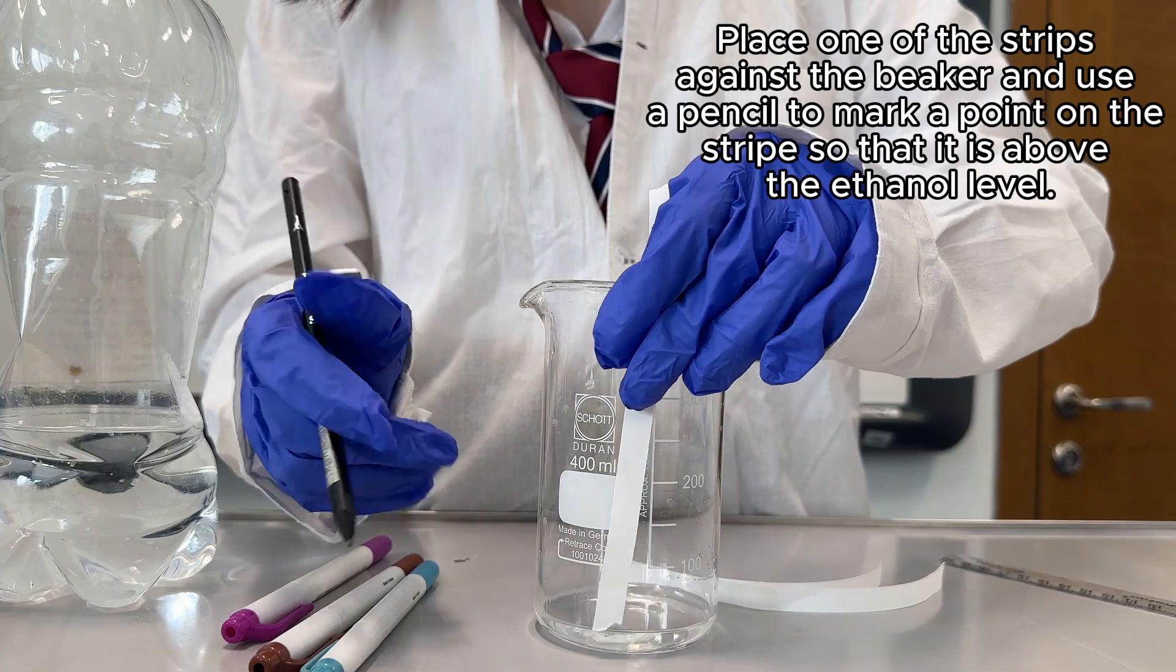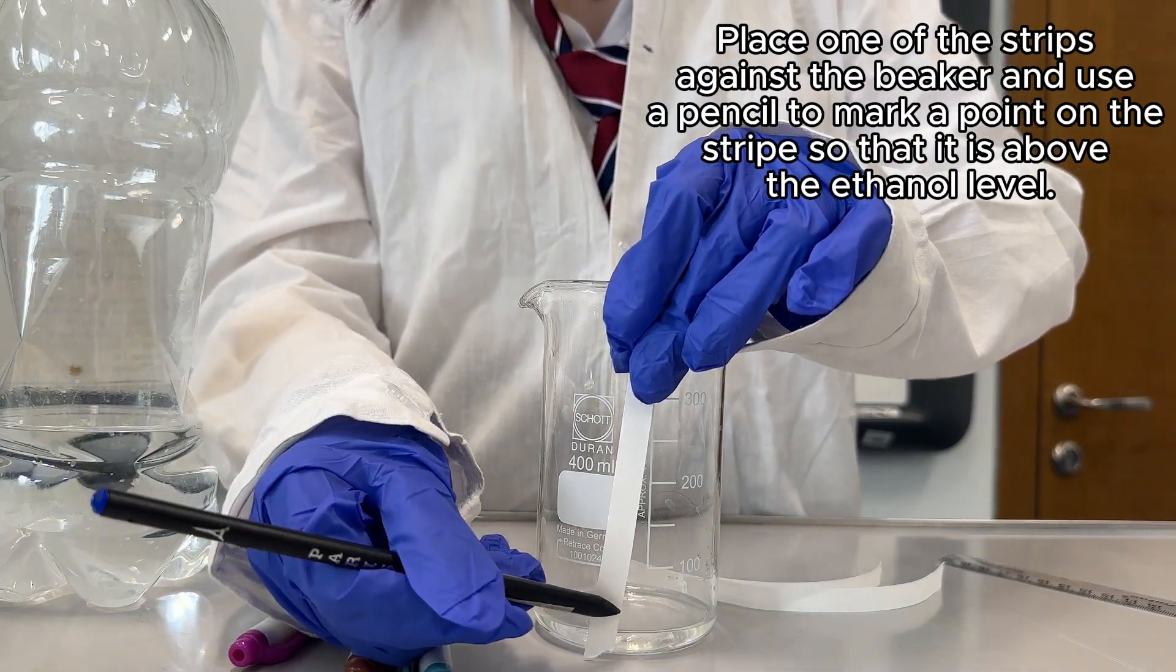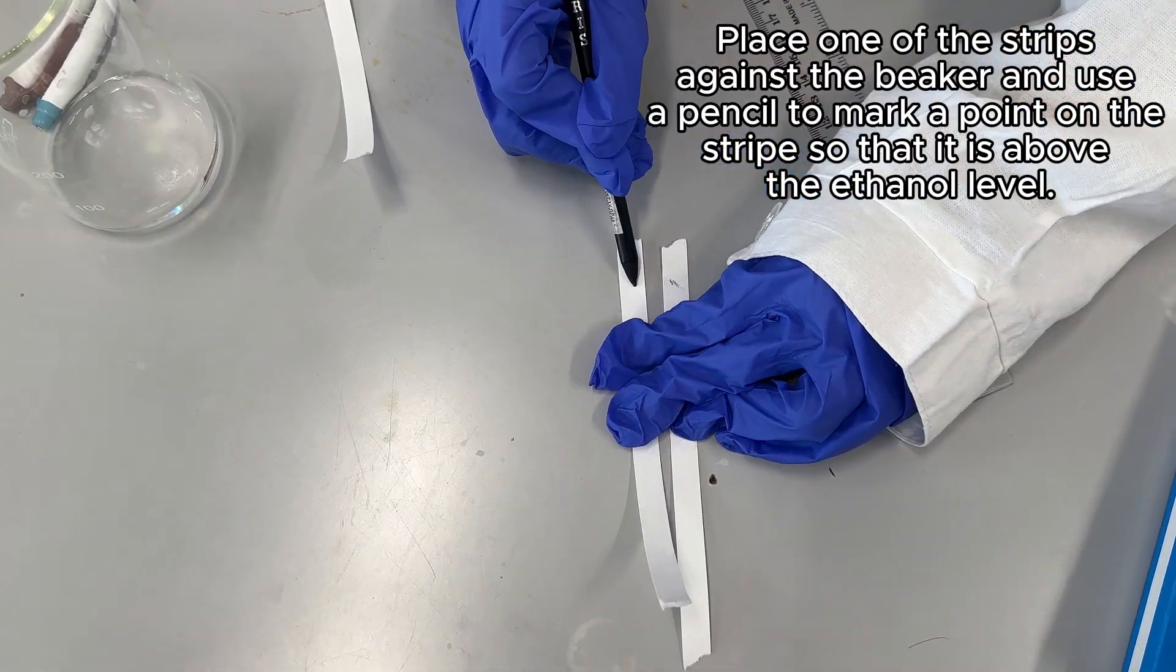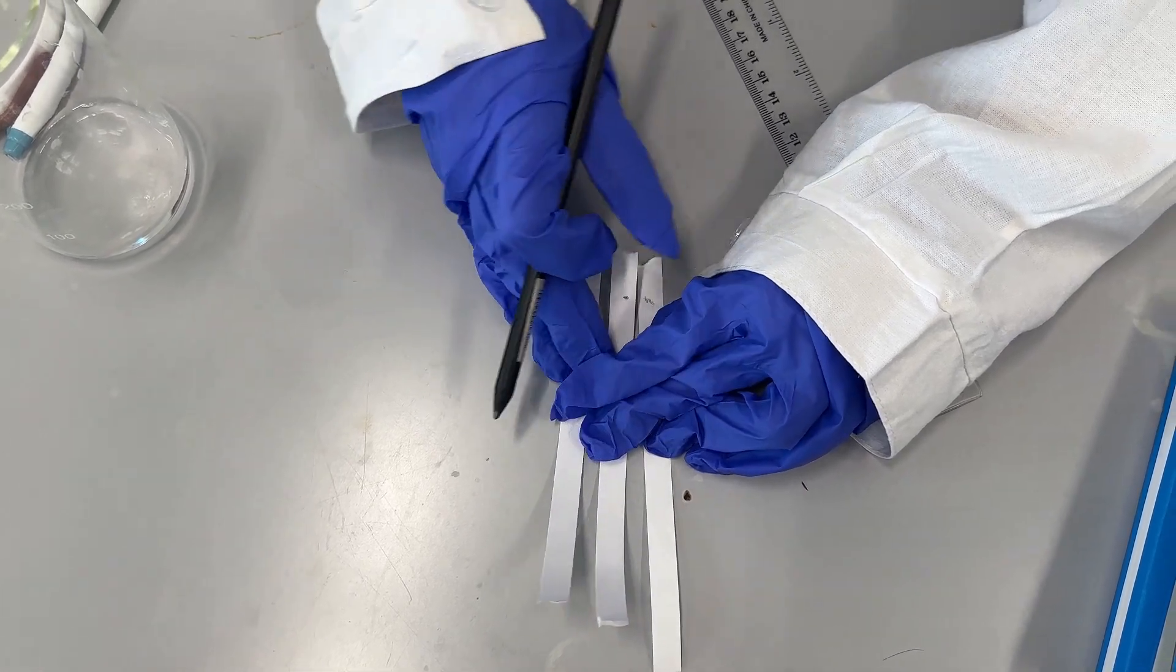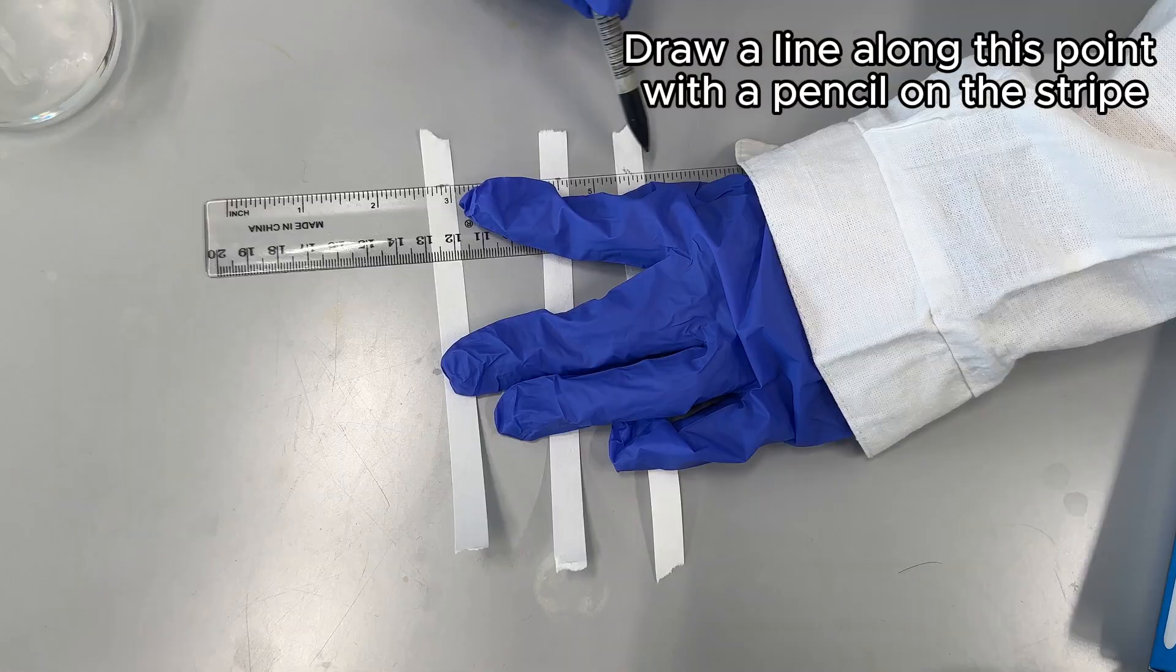Place one of the strips against the beaker and use a pencil to mark a point on the strip so that it is above the ethanol level. Draw a line along this point with a pencil on the strip.